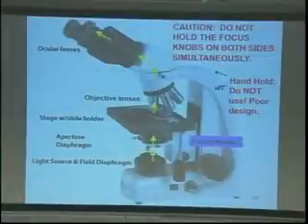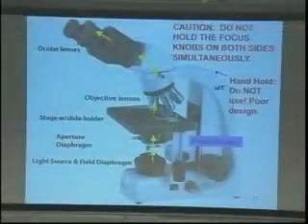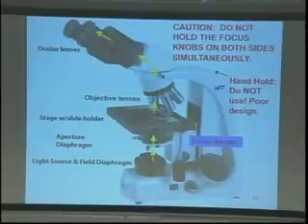It will lift up if you use a little force. You can literally bend it out of the plane. It won't work from then on, but it'll work for that slide, okay? So just use the thumb, okay? We actually had ordered these special for our microscopes, and they were, I think, $40 some a piece for every microscope, because it's a lot better than those clips.